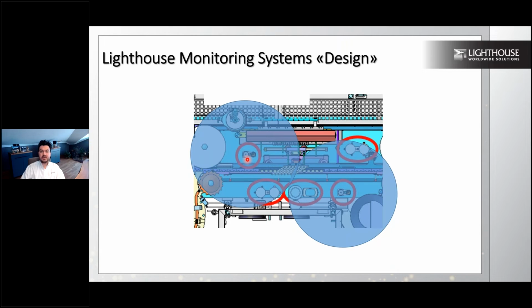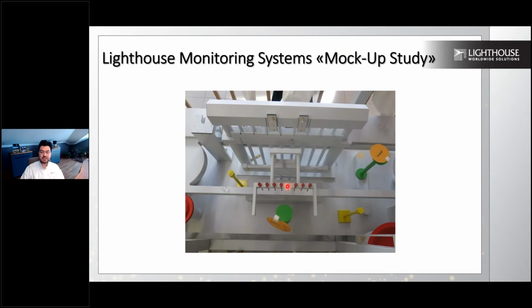The reason here is that I can easily put one particle counter right in the middle, where my laser pointer is located. However, my operators, when they are using this location, will be entering with their two hands through the gloves, and the gloves will be on top of my particle counter. So each and every time they do this activity, all the particles shed from the gloves, or the turbulence caused by them, will give me a high count.